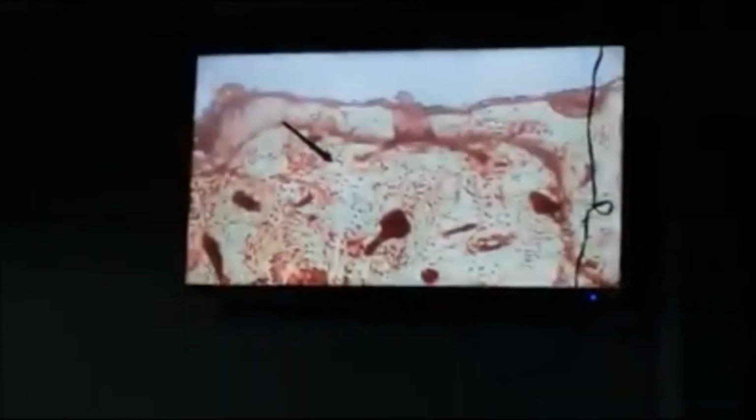Okay? Is there another structure that we need to find for this particular slide? A canal again. It communicates from one Haversian system to another Haversian system. So, what does that mean? The connection of one osteon, this one is an osteon, to another osteon. Now, this structure connecting two osteons or two Haversian systems is known as your Volkmann's canal.